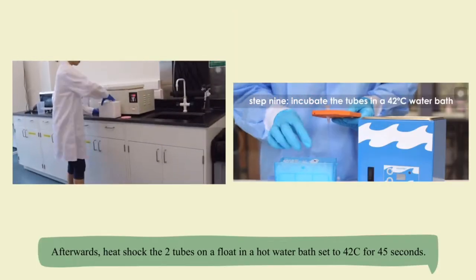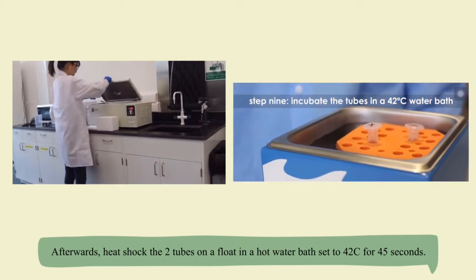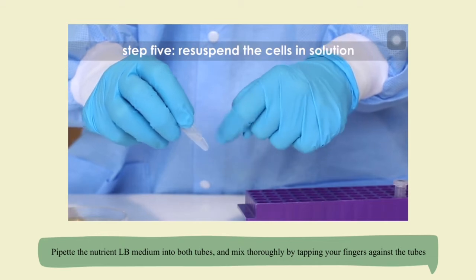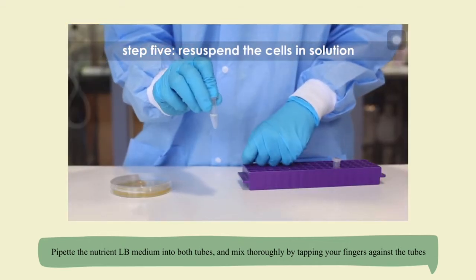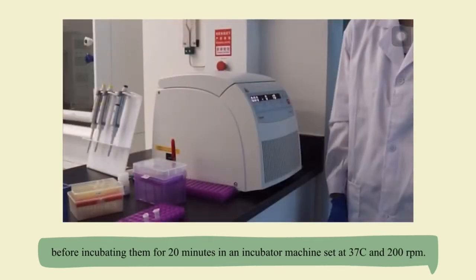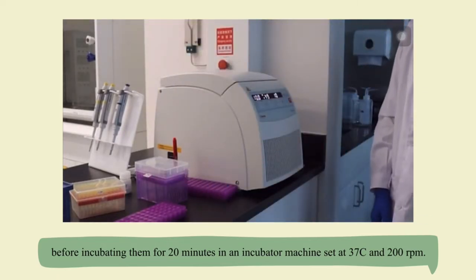Afterwards, heat shock the 2 tubes on a float in a hot water bath set to 42 degrees Celsius for 45 seconds. Pipette the nutrient LB medium into both tubes and mix thoroughly by tapping your fingers against the tubes before incubating them for 20 minutes in an incubator machine set at 37 degrees Celsius and 200 RPM.